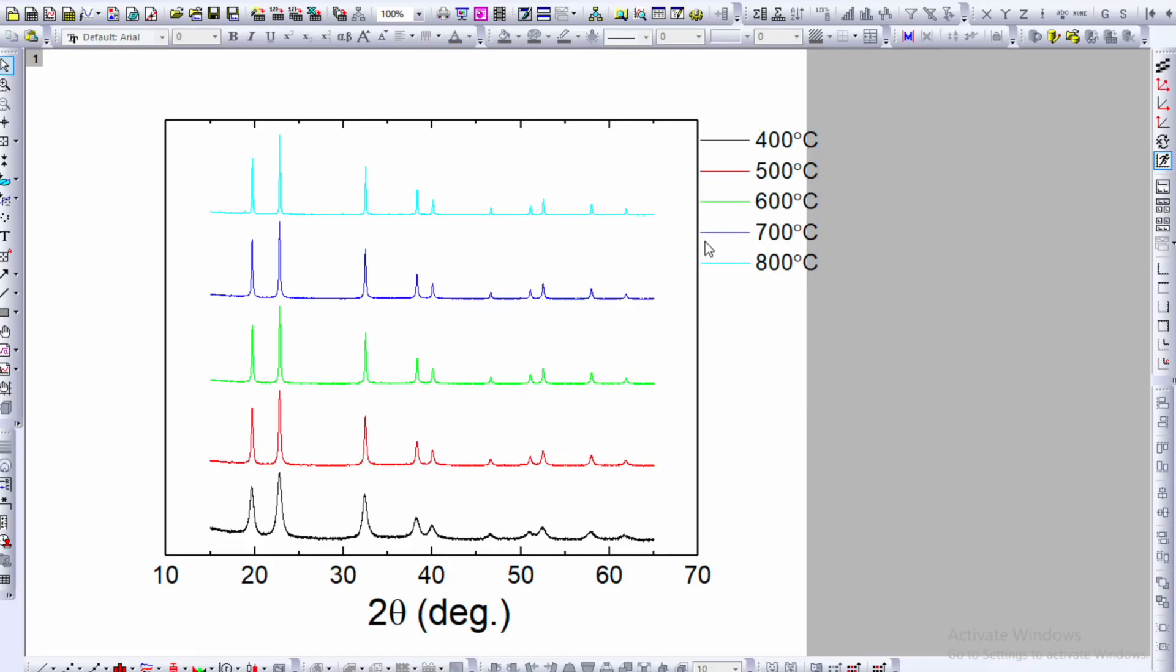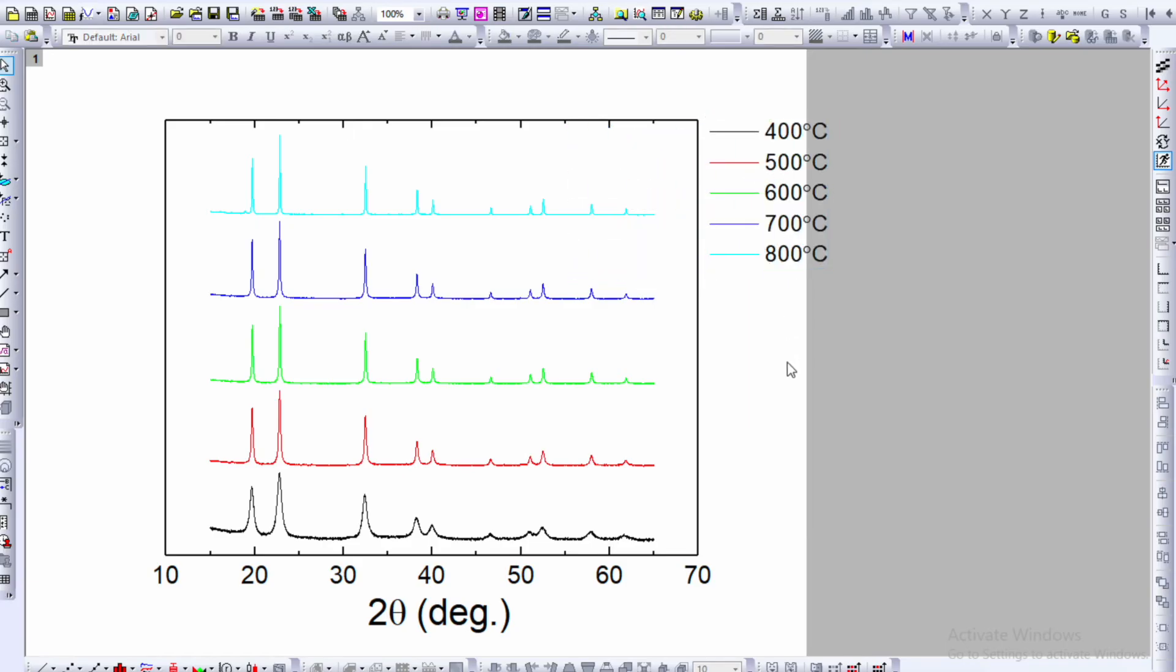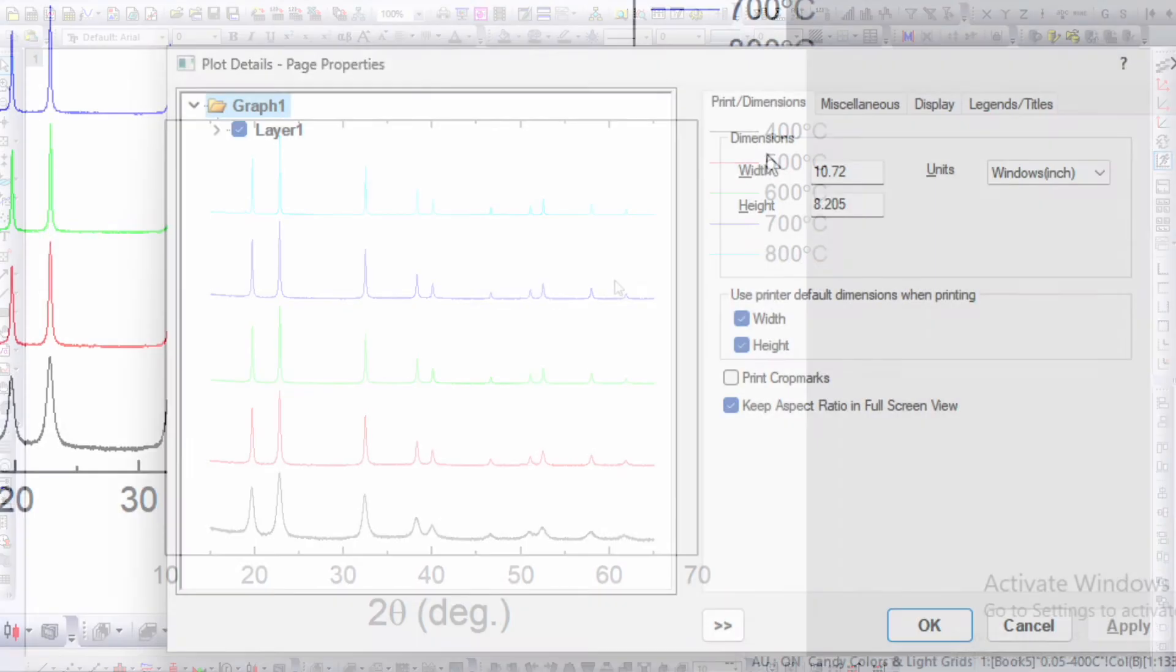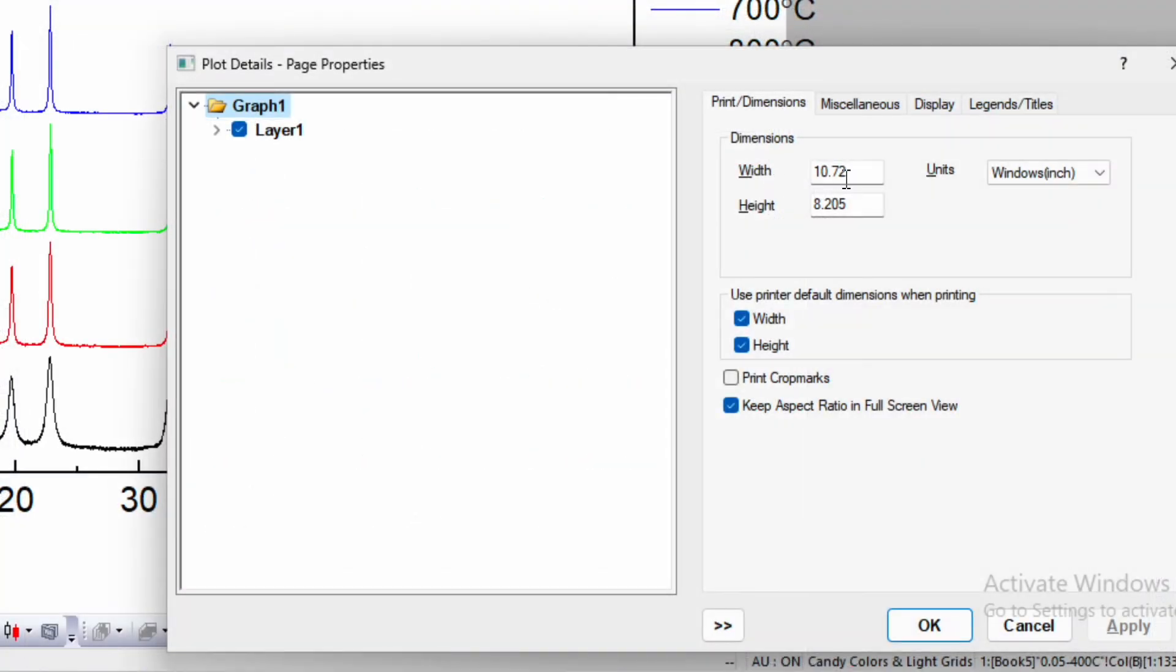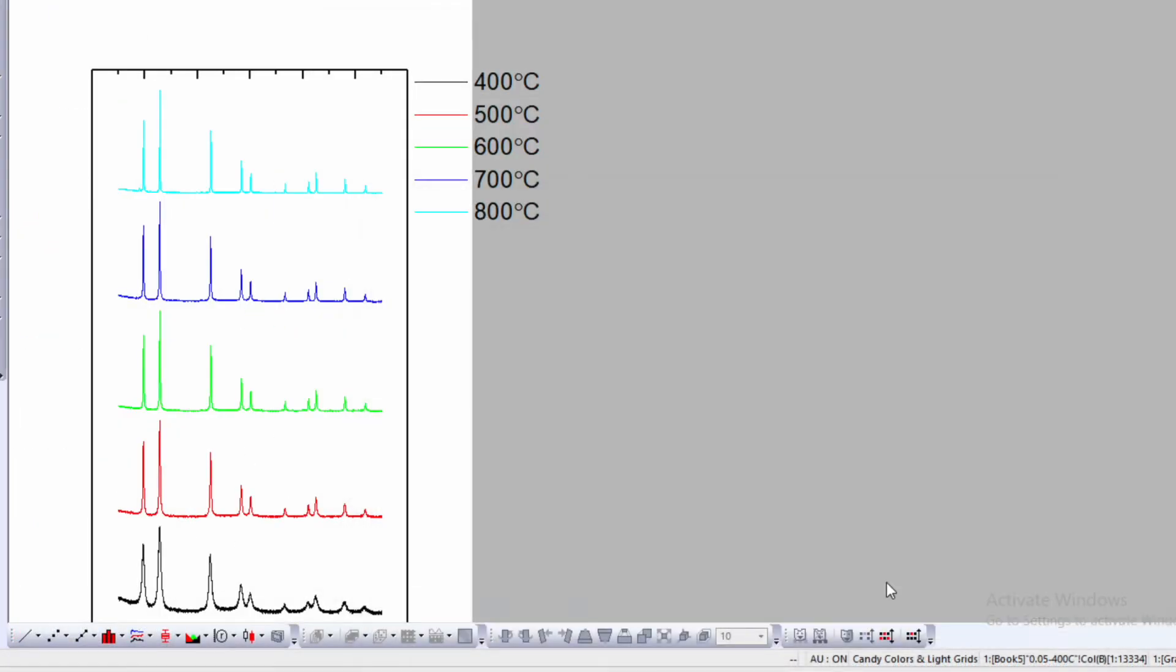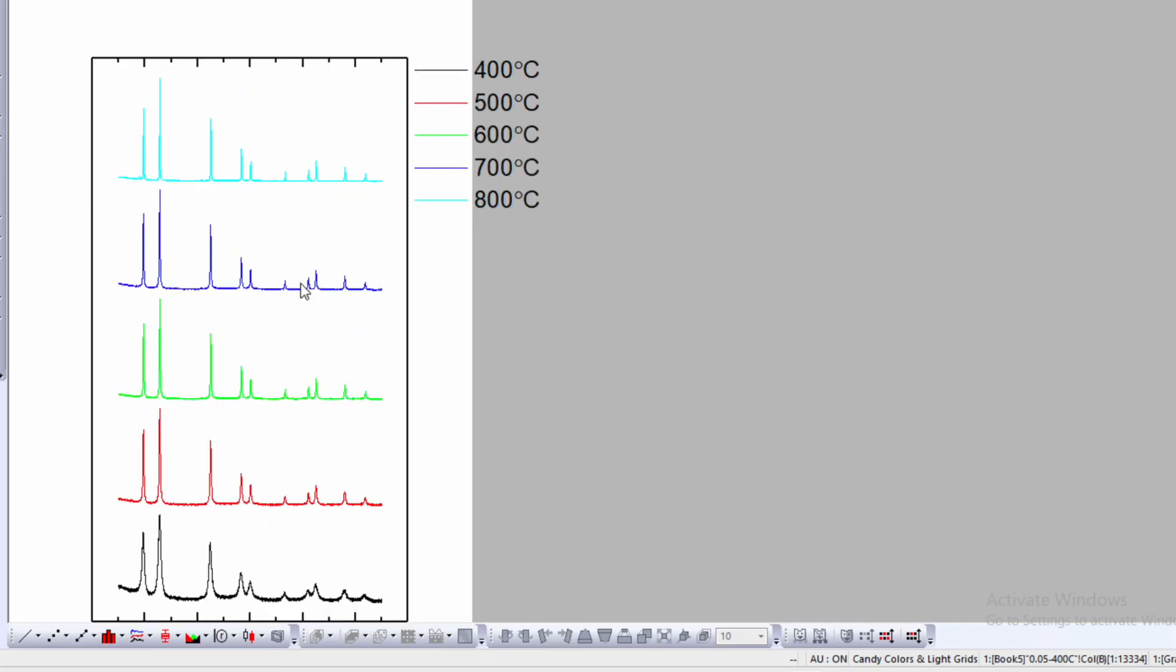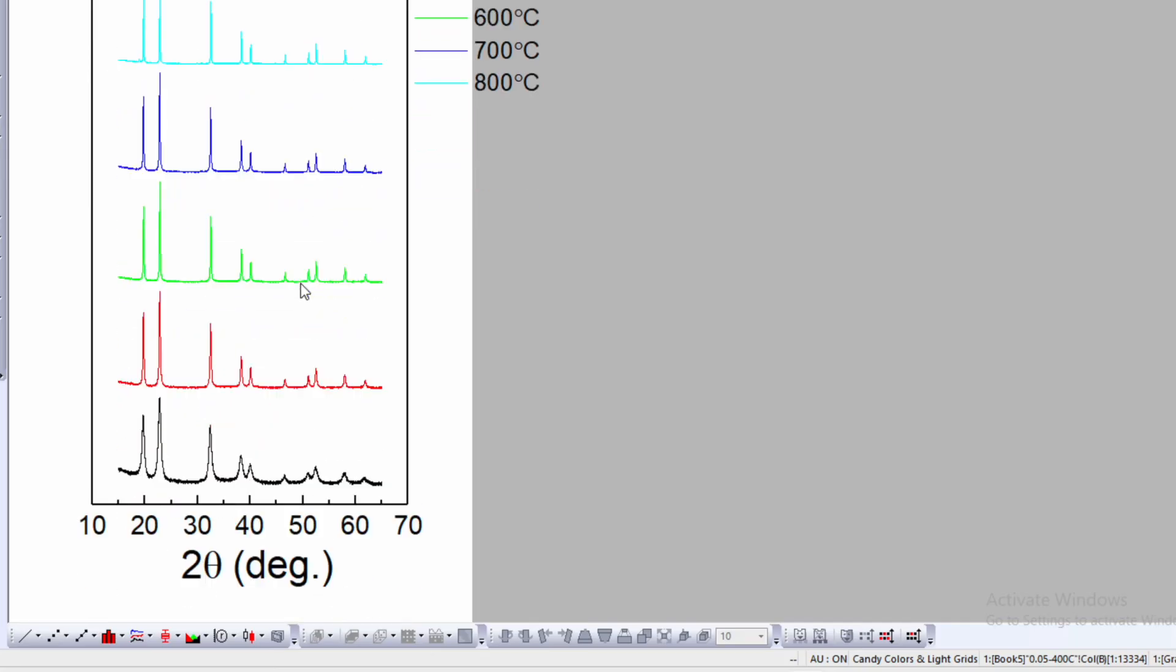It's not easy to fit this box inside the plot, so we can change the dimensions. Press the shortcut key for dimensions. The width is currently 10.72 and height is 8.205. Change the width to 6 and height to 10, then click OK. This changes the height and width.